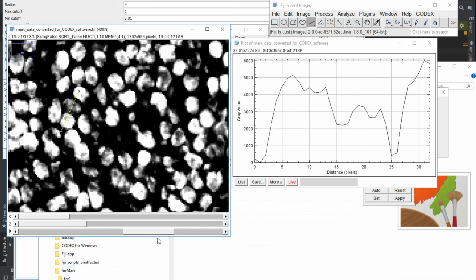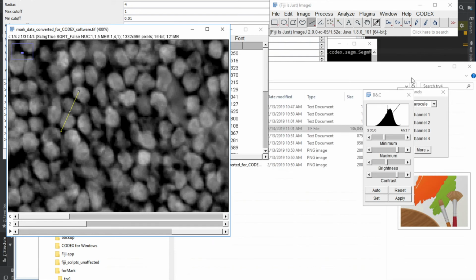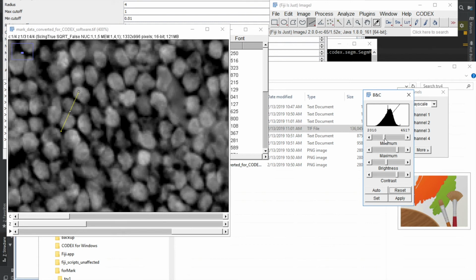But again, segmentation is never optimal. That I can assure you. But just for the sake of the argument, let's see. So here the cutoff should be, I would say, maybe around 1500. Yeah, maybe around 2000, something like this. Which, 2000 over 65,000 is about 3%. Alrighty.